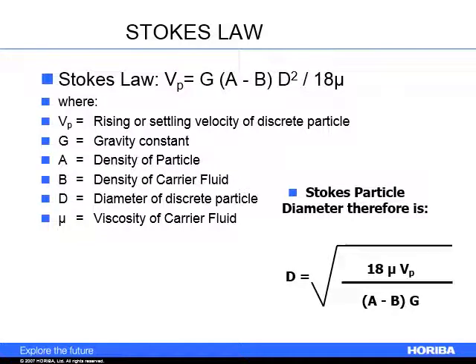This is just the math of Stokes' law. You can see that the settling of particles is related to the density, your fluid, viscosity, and the size. So you can go through all this math. I'm not going to do it here. You guys probably have seen this before, but this holds for when you're trying to figure out how things will settle through a solution with time.